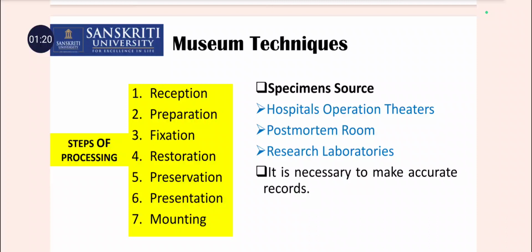And these are the steps we follow for processing the sample for museum techniques. The first one is reception, then preparation, fixation, restoration, preservation, presentation, and the last one is mounting.